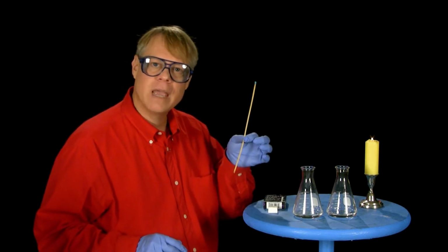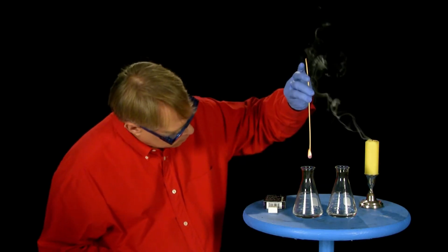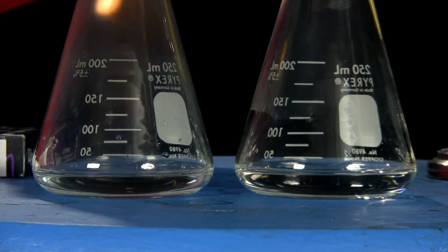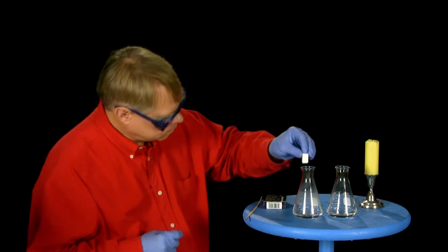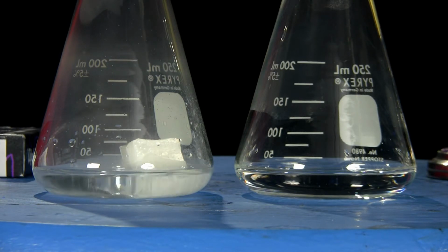Here is a jar containing some hydrochloric acid, and here's a taper which, if I put it into that jar, will show only the presence of common air. There is, you see, pure air down to the bottom. The jar is full of it. Here is a substance, marble, a very beautiful and superior marble, and if I put that piece into the jar, a great boiling apparently goes on. That, however, is not steam. It is a gas that is rising up.